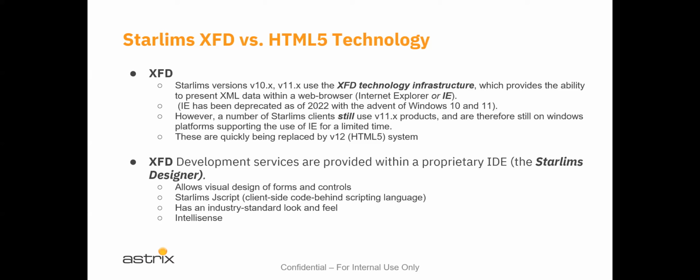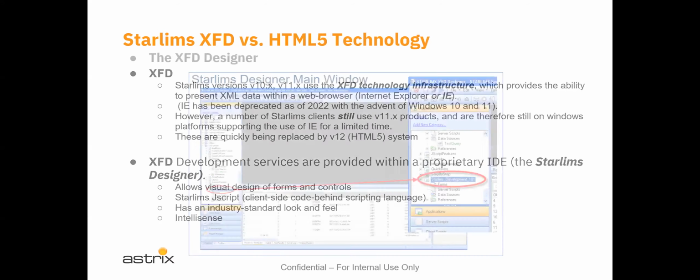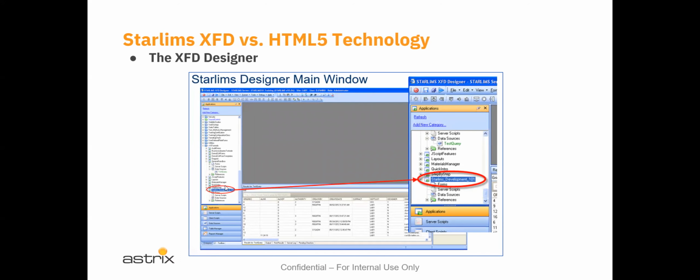The IDE has an industry standard look and feel. It looks pretty much like Visual Studio. It emulates the functionality in there. So if you're familiar with using that, for example, you'll have no problem using this. It also has IntelliSense. So as we're coding and adding code inside of there with functions and whatnot, using the dot as in .NET, we're going to get IntelliSense for functions, for controls, and for calls, server calls. This is what the designer looks like at the high level.